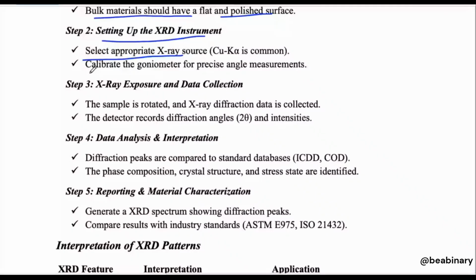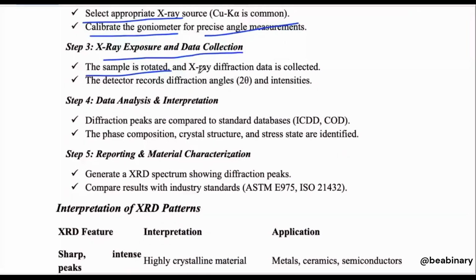The third one is X-ray exposure and data collection. The sample is rotated and the X-ray diffraction data is collected. The detector records the diffraction angle 2 theta. So here, what we have shown you is this angle, which is basically 2 theta, not only theta, basically 2 theta.